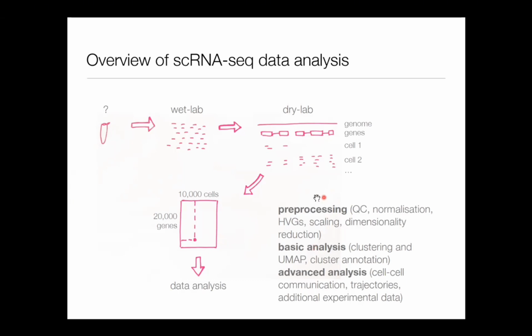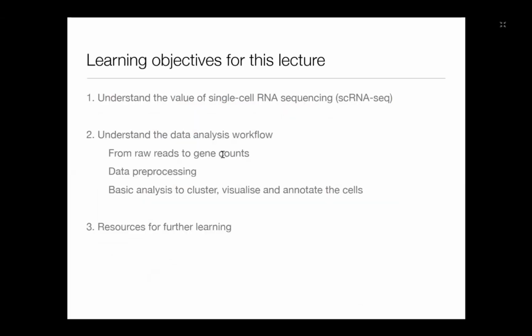Today, I will focus on the first 2 steps. The learning objectives for my lecture today are to give you, again, an understanding of the value of single-cell sequencing; to understand the data analysis workflow, so how we go from raw reads to gene counts, data pre-processing, and basic analysis to cluster, visualize, and annotate the cells. And then I will give you some resources for further learning.